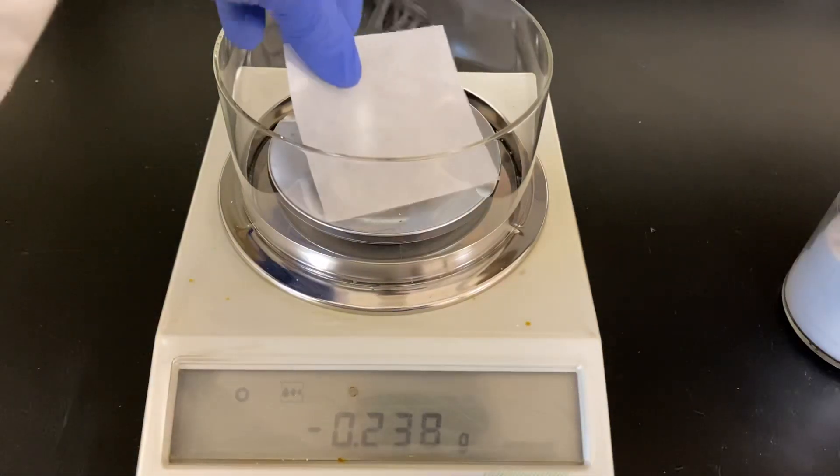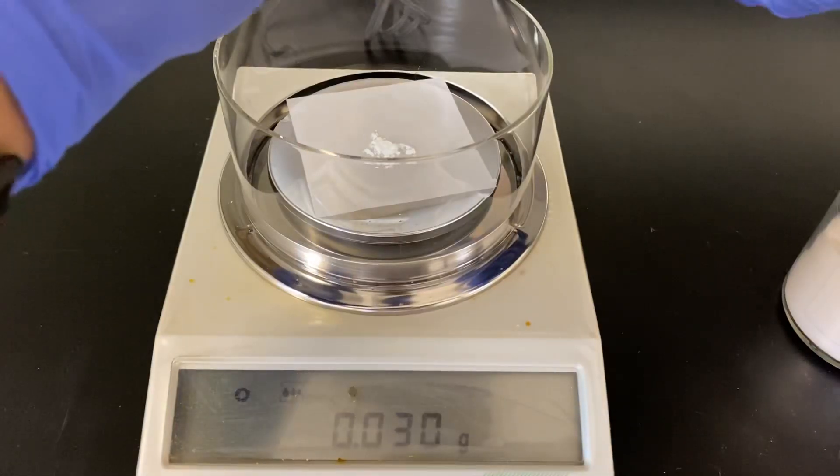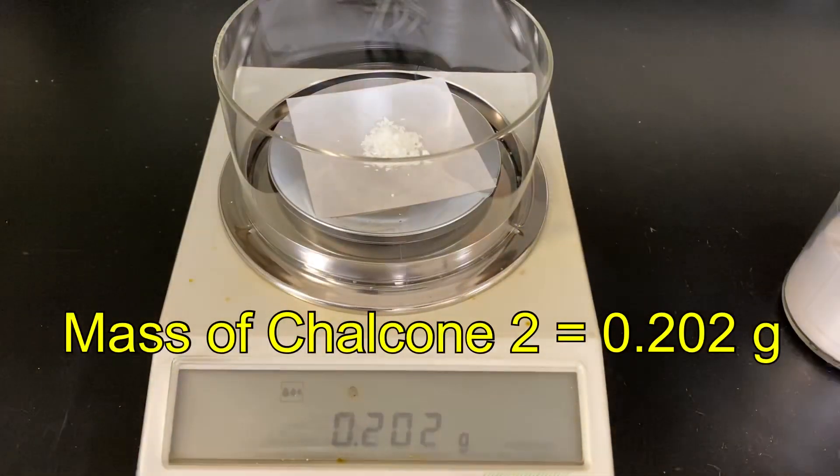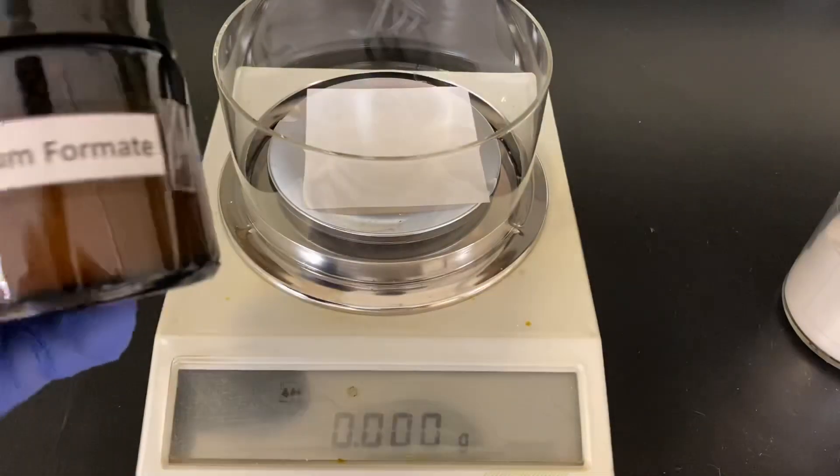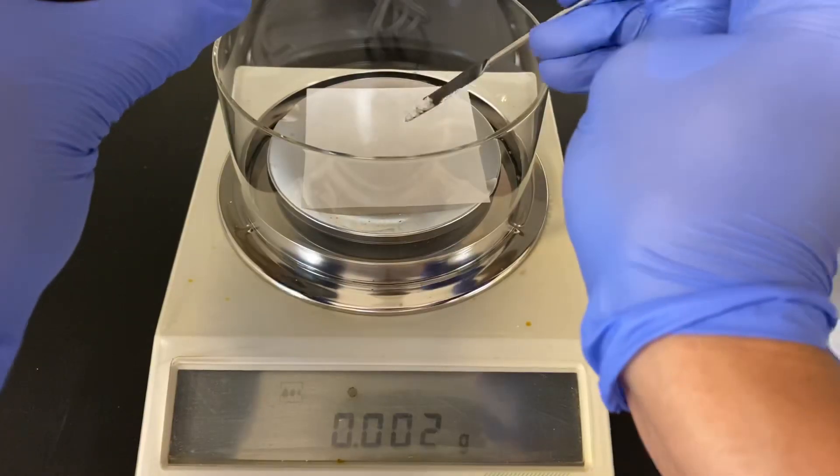For the catalytic reduction of the substituted chalcone 2 experiment, the initial mass of chalcone 2 used was 0.202 grams. The mass of ammonium formate used was 0.378 grams.